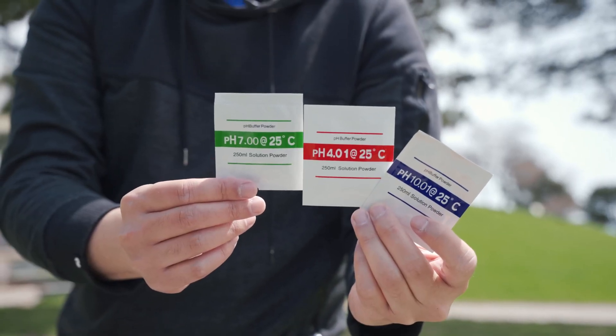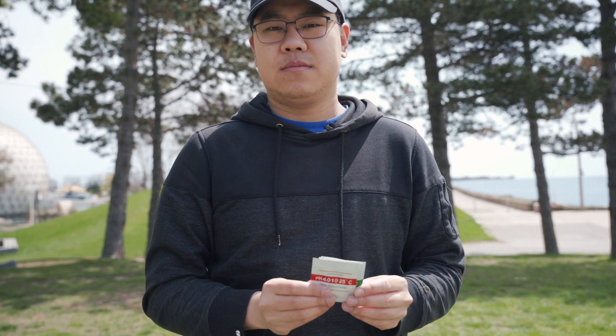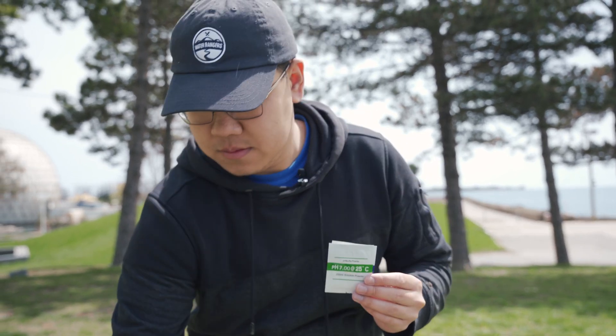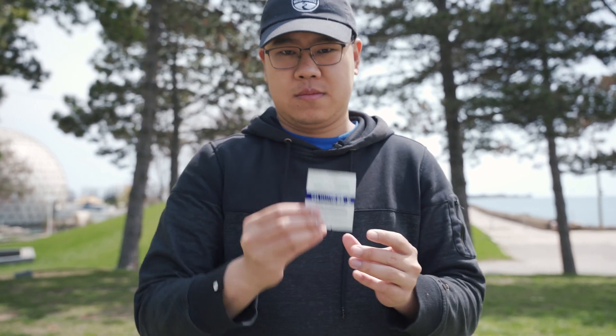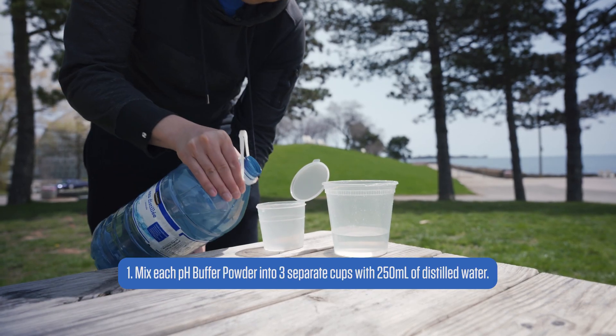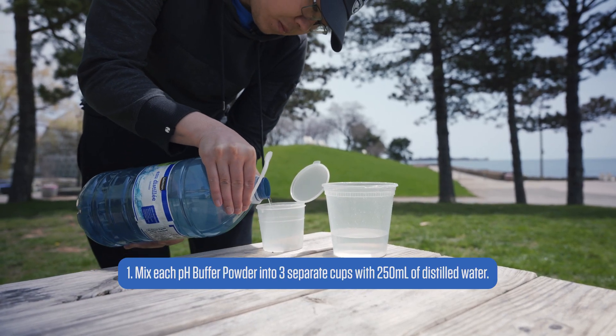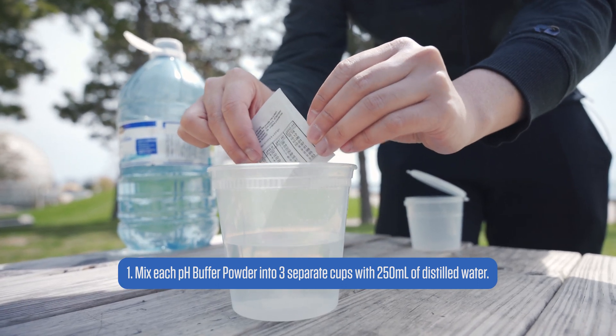To start, we will need our calibration solutions. There will be three packs that you will need for this with the pHs of 4, 7, and 10. On top of that, you will need three cups that can hold 250 milliliters of water and a big bottle of distilled water for the solutions. Once the calibration solutions are prepared, make sure to have some extra distilled water to rinse the meter.